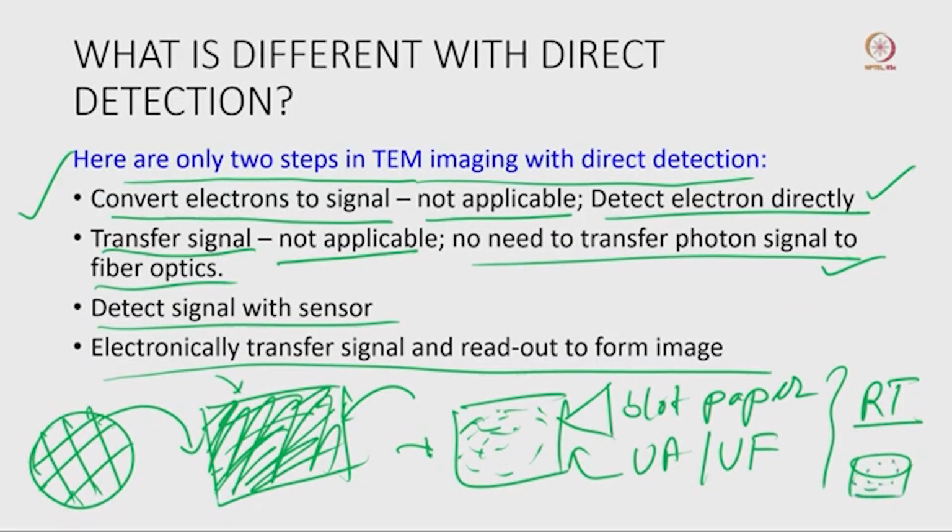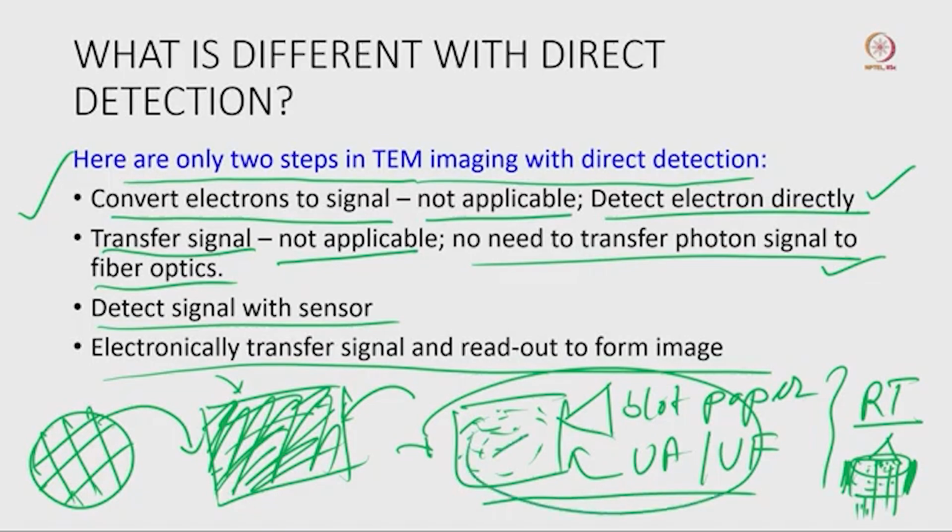In the cryo condition you have ice, and this is the carbon area as I discussed, and inside the ice you have the sample, and you want to image it. If you have amorphous ice and the electron beam is passing through this sample, there is a high chance of thermal drift, or continuous motion. That motion is not possible when you are imaging something in a dry condition, on a carbon platform, where the sample is not in amorphous ice.